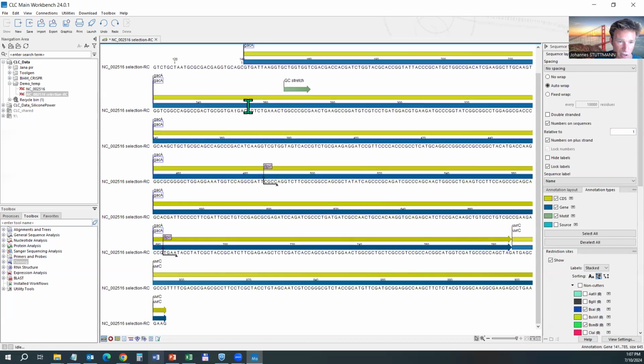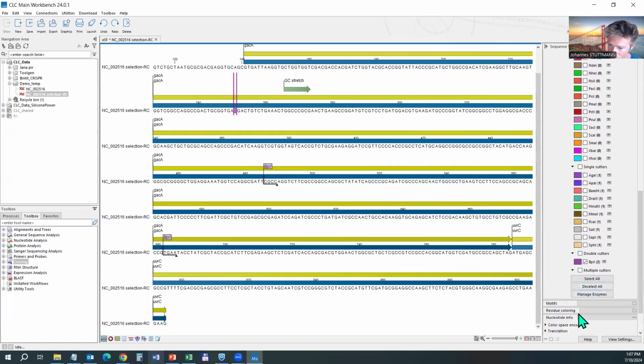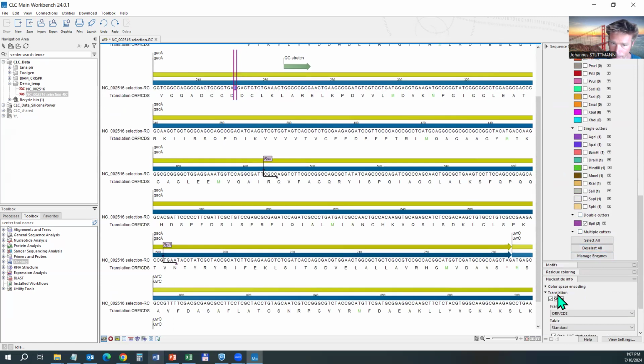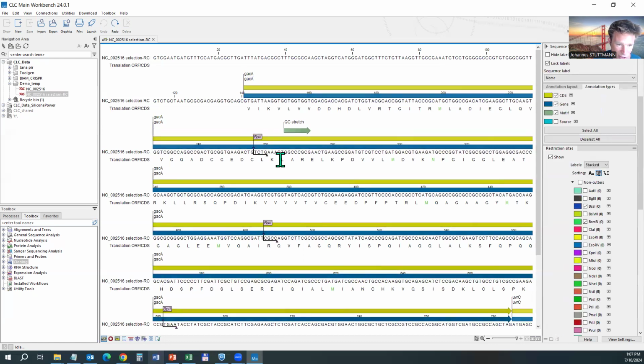eliminate these three Ns. Let's just see what I did with this A to T exchange that I just randomly inserted. So I can turn on the translation to see the sequence of GAK, and I might actually have been lucky. So if I press Control Z again, it comes back to GAA, and this was coding for an E. And so I was not lucky, so I redo it. Redoing is Control Y. So I changed this to a D, to an aspartate.